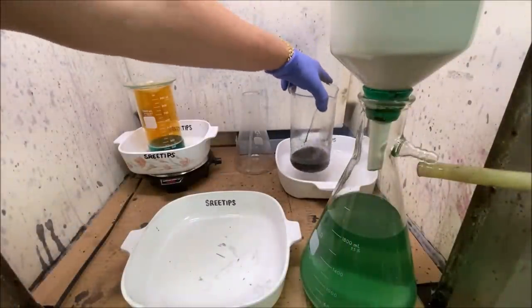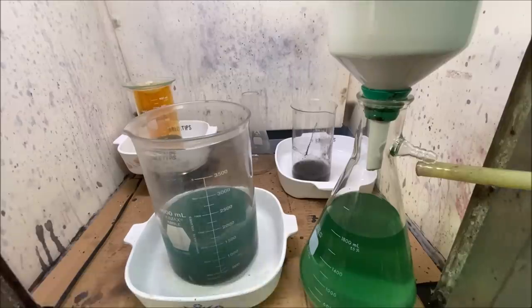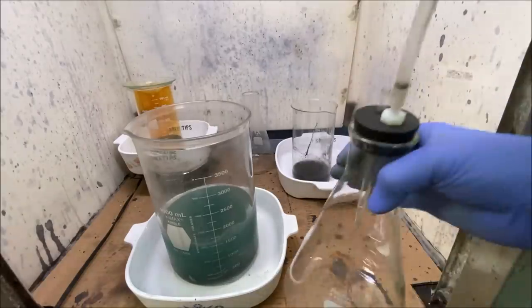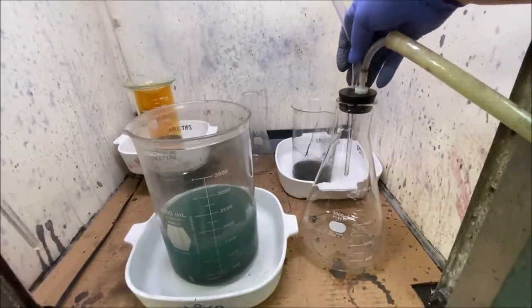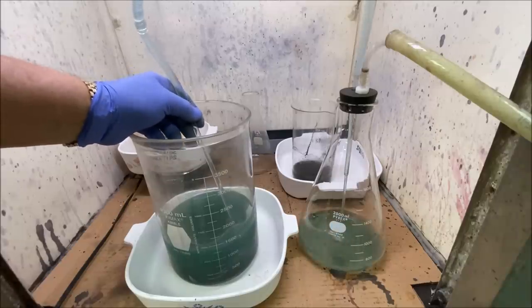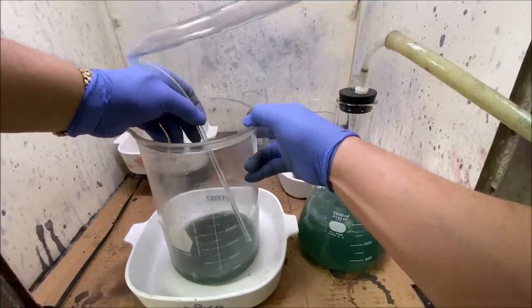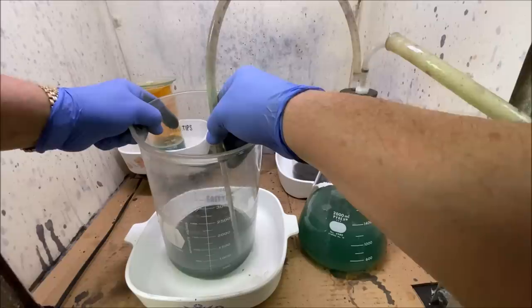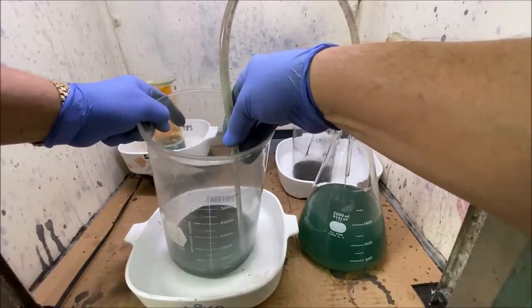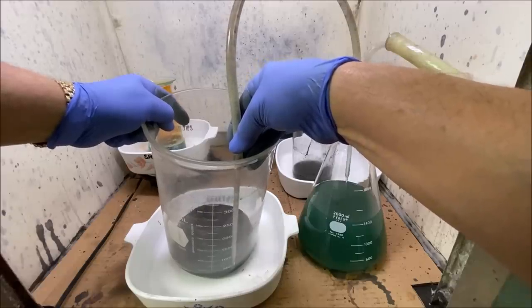Set this back out of the way. Now we're going to get the liquid off of this. There's some solids in the bottom of this solution. Let's move this out of the way. Bring up our vacuum bottle here. Now we're going to pull the juice off of these solids down in this beaker. All right, let's get our vacuum bottle out of the way here.